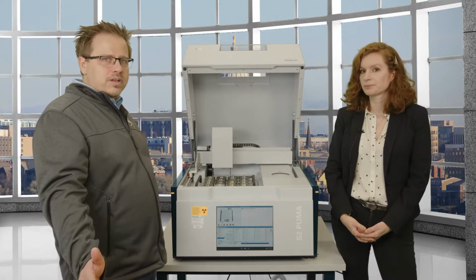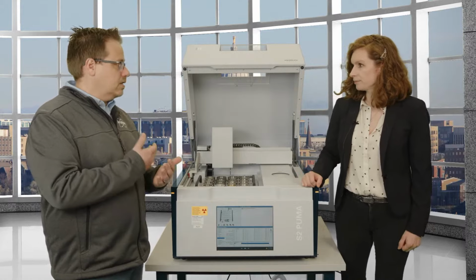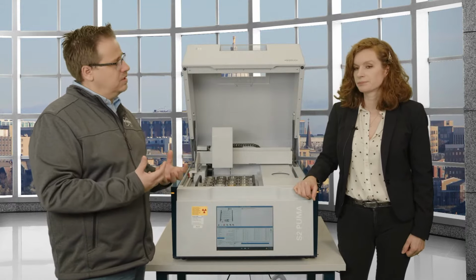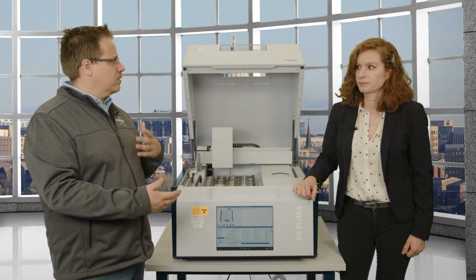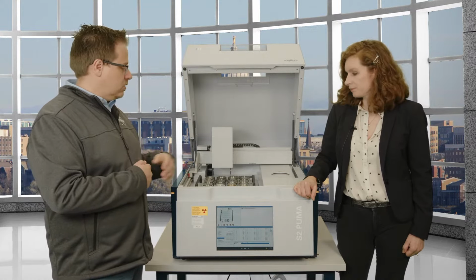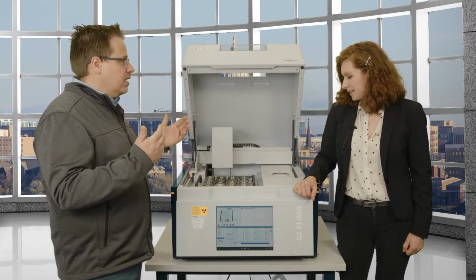One other thing that sometimes people don't think about is that for EDS and SEM, the sample has to be somewhat conductive. And there are some solutions out there to solve that. You could coat it, or there are special SEMs. But if you get sample charging, that's a big issue. So things like the cookies might be an issue there. With XRF, you don't have that sample charging.